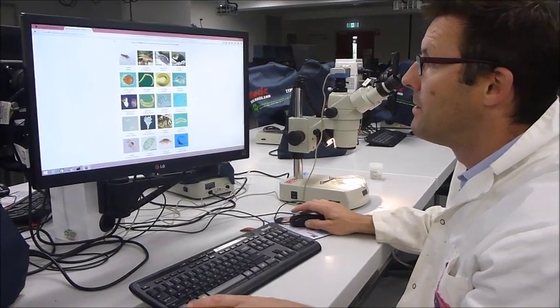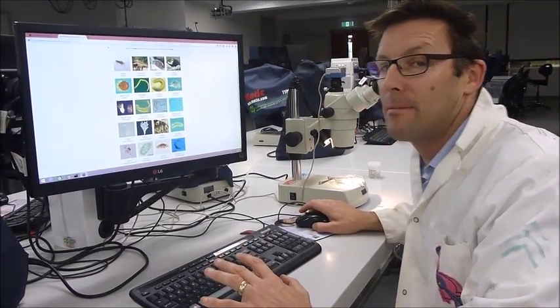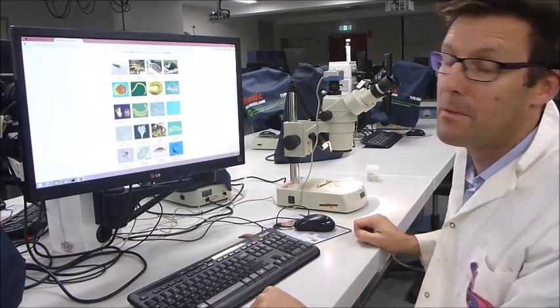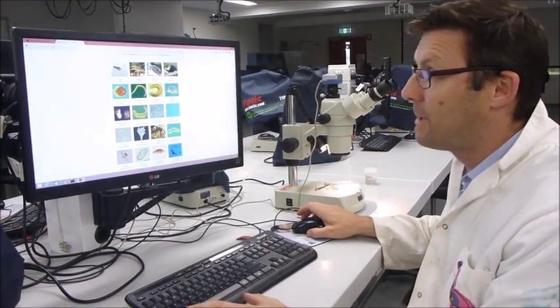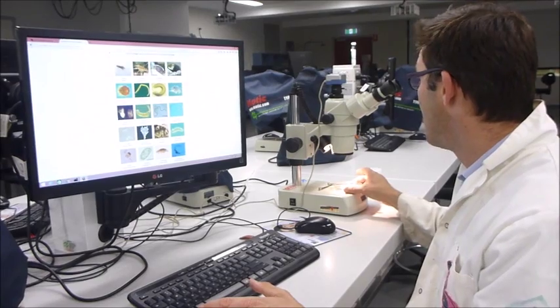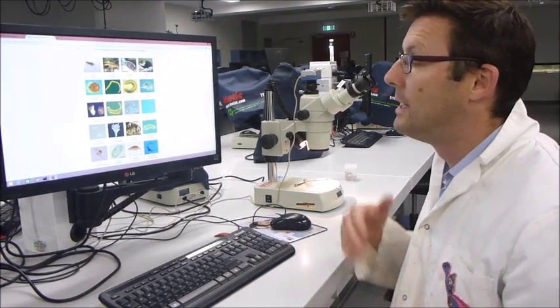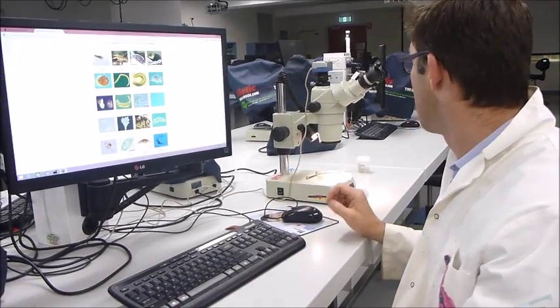And for chironomids, Chironomidae, which is a Diptera family, you should aim to identify them to subfamily level, and that should be possible with the keys you have. So work through, identify all your animals in your Petri dish, write them down in your lab book, the name and the count. Once you've done that for your kick sample, go and do exactly the same process for your rock sample. Keep those two data sets separate.